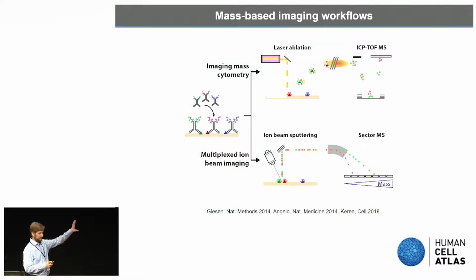Now, I have been covering the fluorescence and dye-based methods, but there are also those methods that use mass tags for tissue imaging. Here, all antibodies are simultaneously added on the tissue, and each antibody of a defined specificity is coupled to a unique metal isotope of a defined mass. Then we can use a mass spectrometer to determine in a given tissue area the metal concentration and which metal isotopes are present. Then there are two variants.